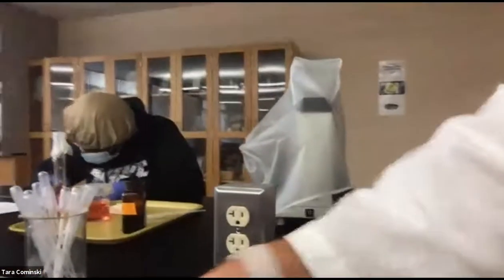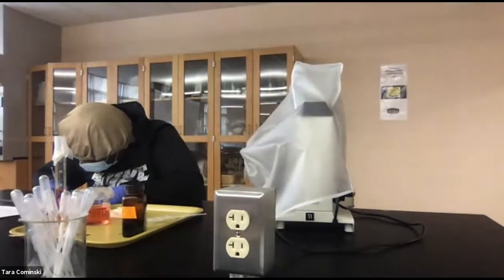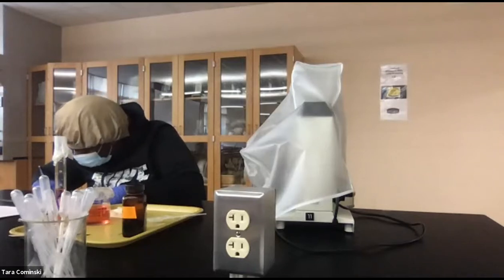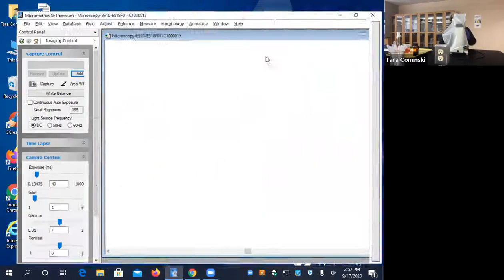So now we're gonna move on to the microscope, okay? What I want you guys to do is just uncover your microscope, turn it on, get the light on, and we'll go from there, okay? You want us to take this off now?